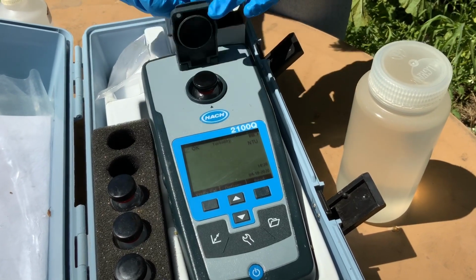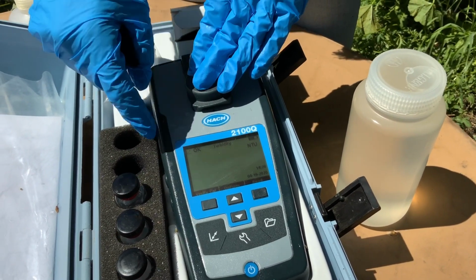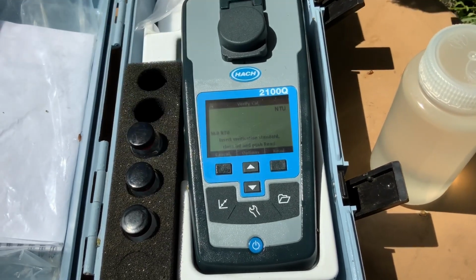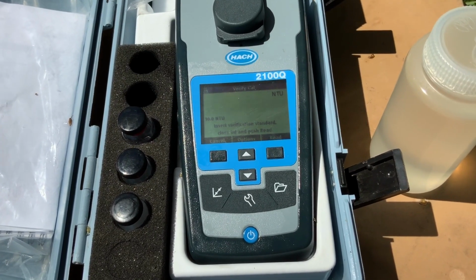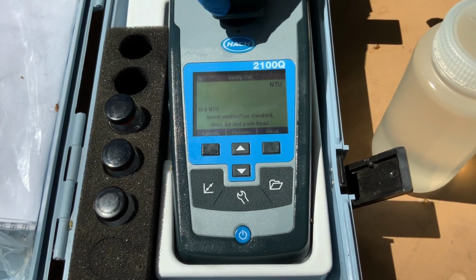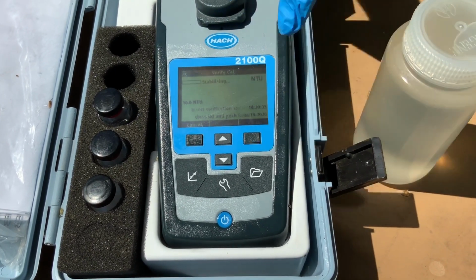Okay. And now I'm going to close it, and I'm going to verify the calibration. So I press verify cal, and it says insert verification standard, close it, and push read. So I will push read.